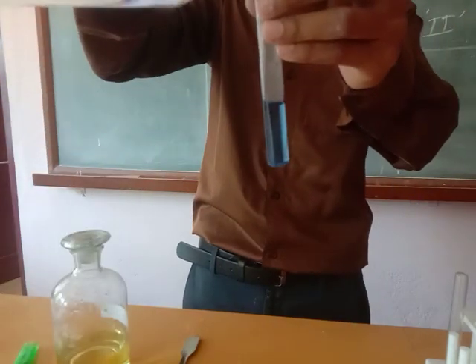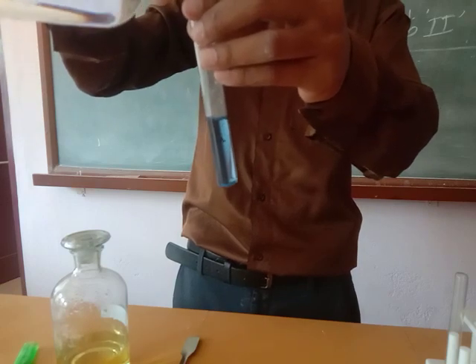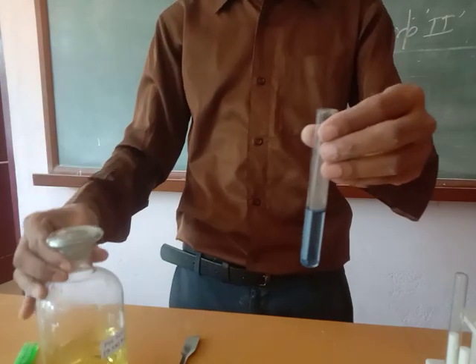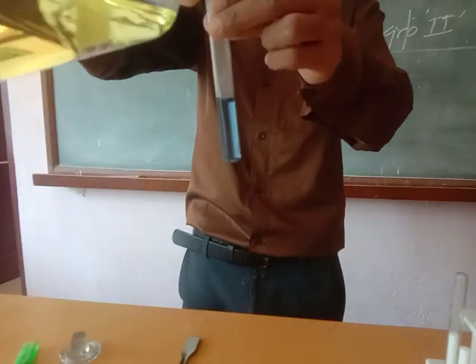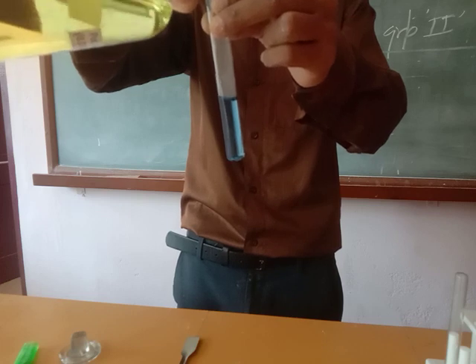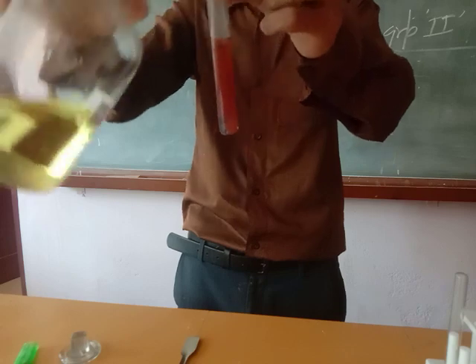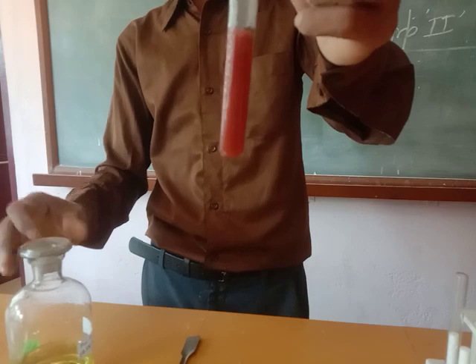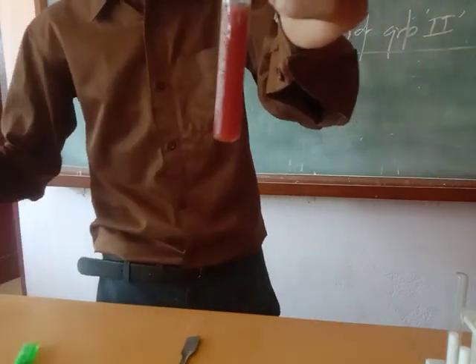Here you put acetic acid. So this is potassium ferrocyanide solution. This is the confirmatory test for copper ion. After adding potassium ferrocyanide, if you observe chocolate brown PPT, only then copper is confirmed. So you see here, this is the chocolate brown PPT, and it confirms that our basic radical is copper.